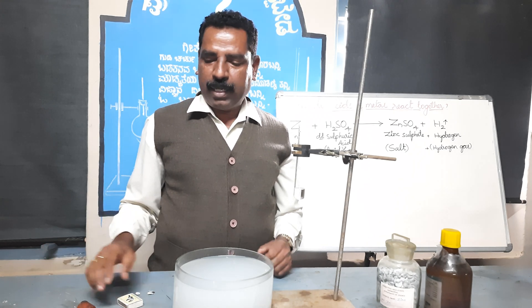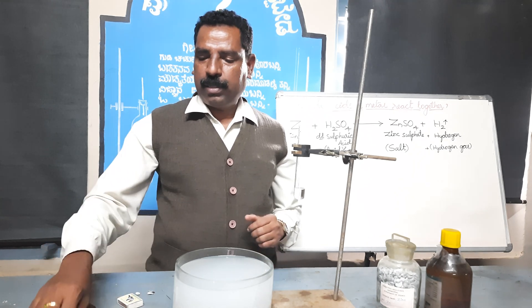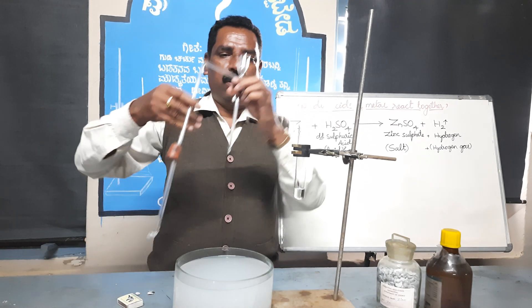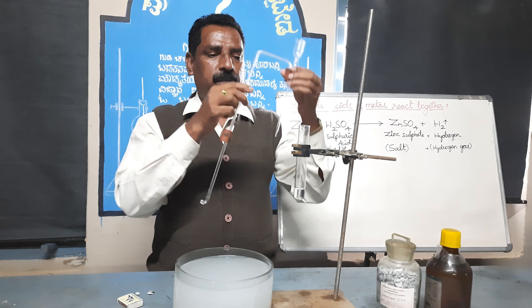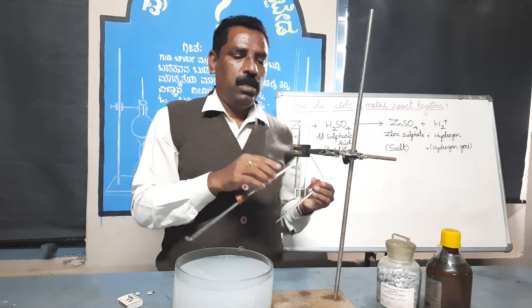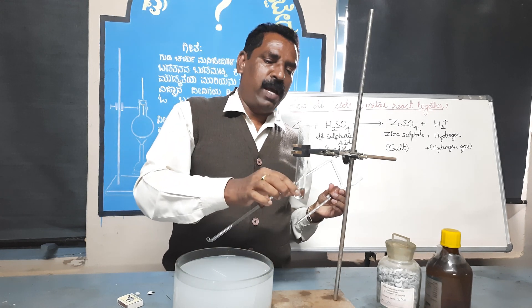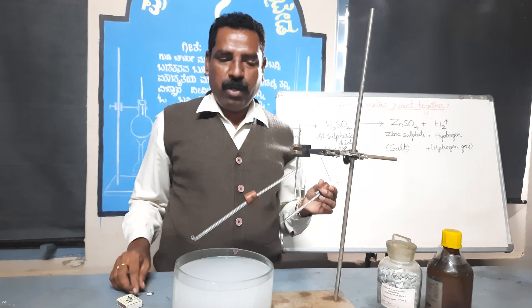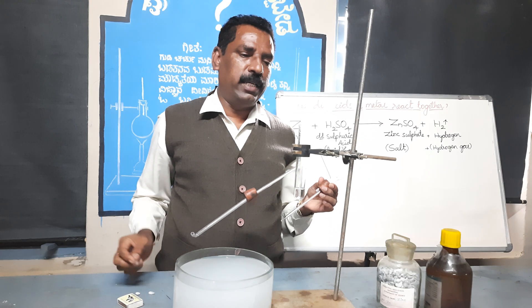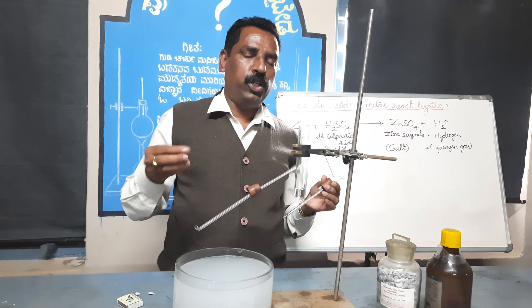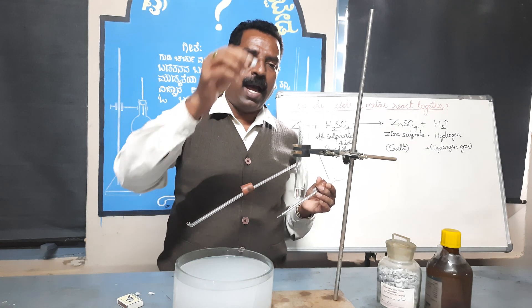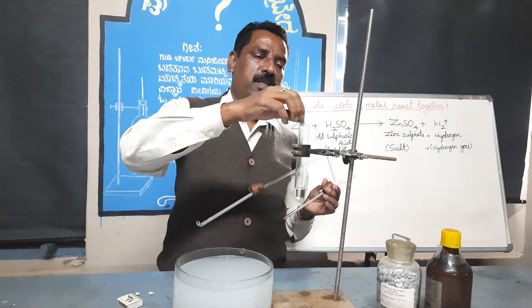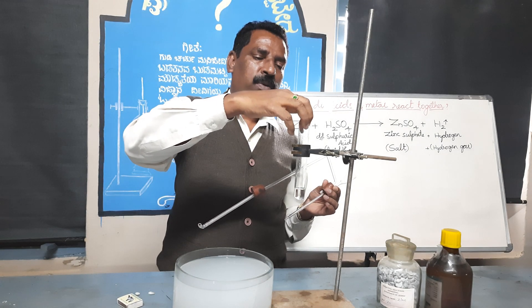Set the apparatus as shown. Take 5 ml of dilute sulfuric acid in a test tube and add a piece of zinc granule.